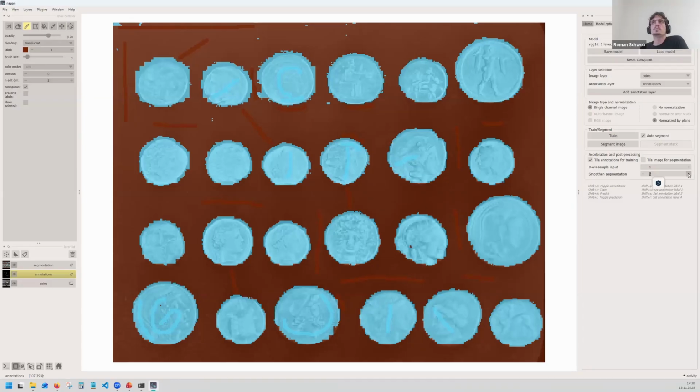What it does more intuitively is, as it says, it smoothens. So it removes small details like these single pixels here, because it analyzes and sees that these are just two single pixels within the other class, and then it can remove them.